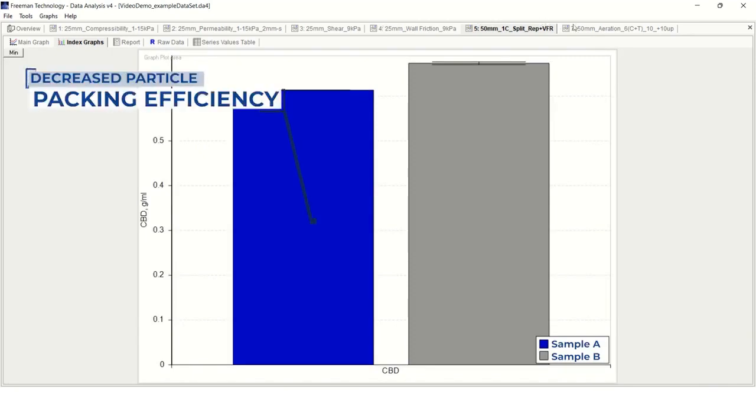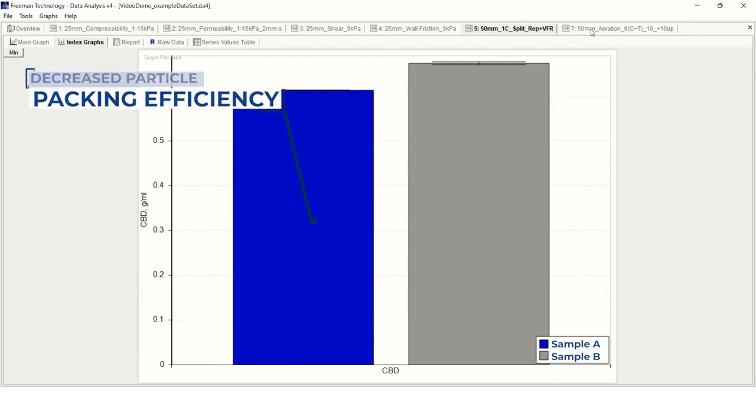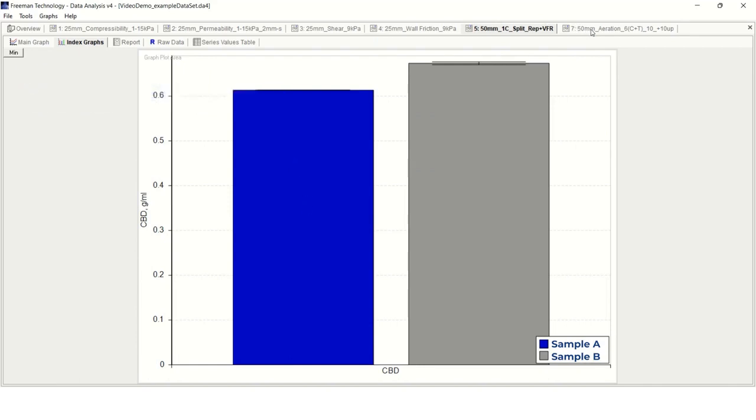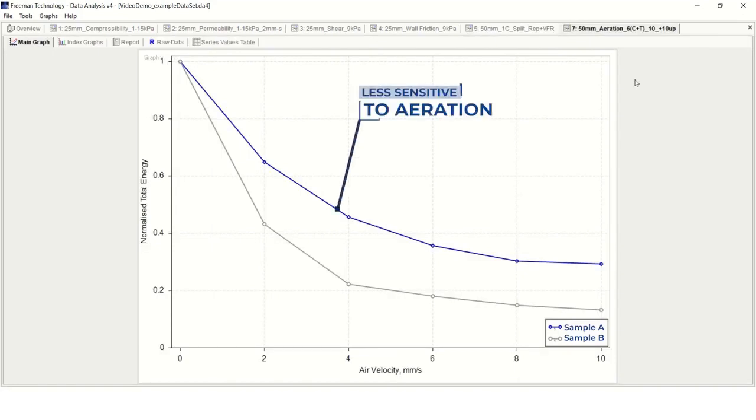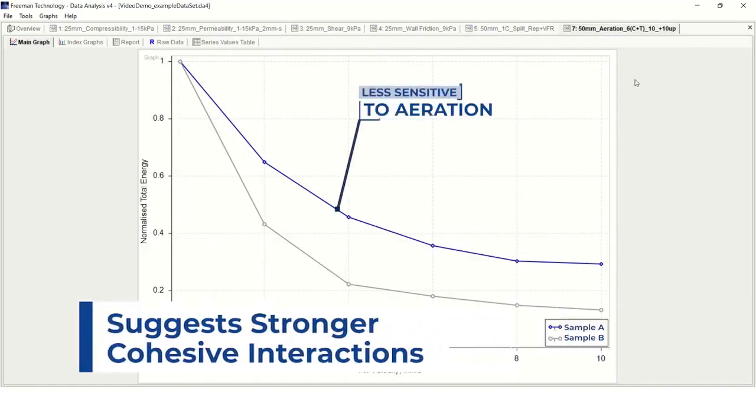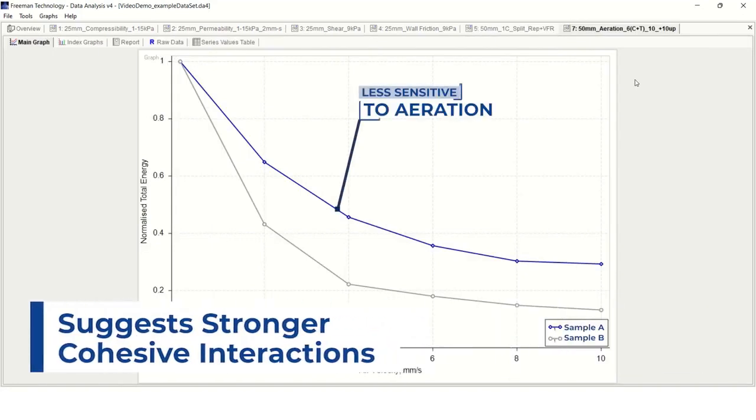We can also compare these samples over a wide range of other experiments done on the FT4. For example, the aeration data shown here indicate that sample A was less sensitive to aeration, suggesting that it has stronger cohesive interactions.